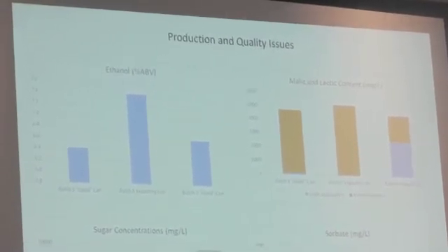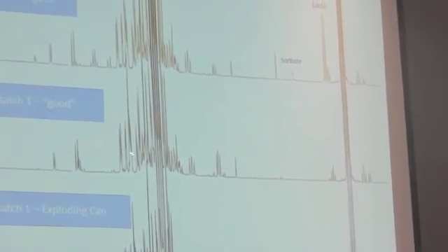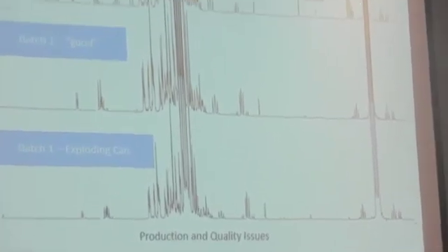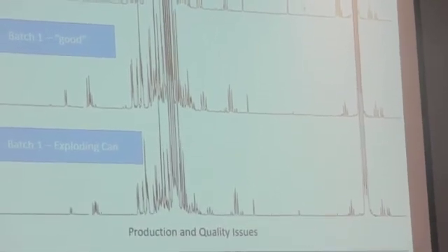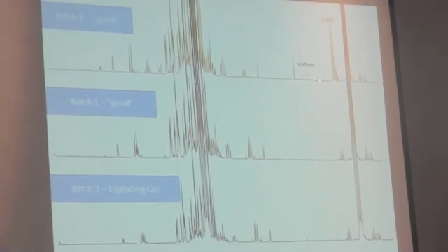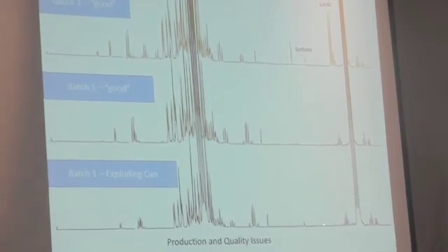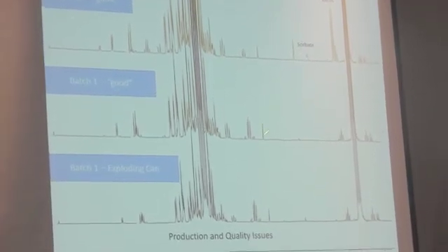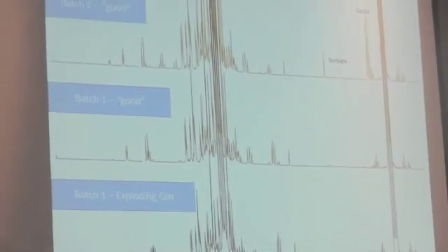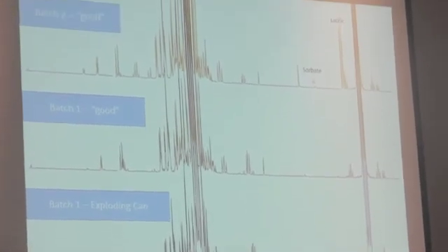But then they did a second batch, and when we ran the second batch, these were supposed to be the same ciders, but a different batch. You'll see that in this one, there's no lactic acid here. There's two peaks here. So in one they got malolactic fermentation going on, and in the other they didn't. Then when you looked at the second batch, these two peaks right here are sorbate. And there was half the amount of sorbate in this batch as there was in the other batch. So maybe this was the problem why the fermentation carried on: they hadn't dosed it enough with the sorbate.